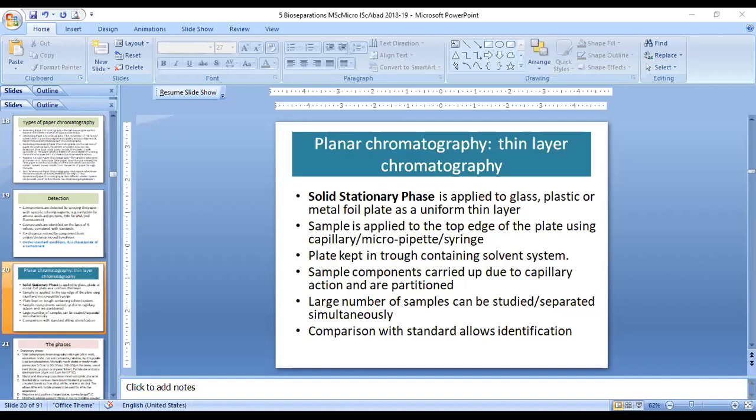the path over which the separation is going to happen is quite important, because if the length is very small, then you cannot expect very good separation. And if the length is bigger, then of course you can expect better separation, but it will also take more time. So you have two things here: one is the time, and the other is the efficiency of separation. So you have to have the optimum separation, depending on your experience and the application.